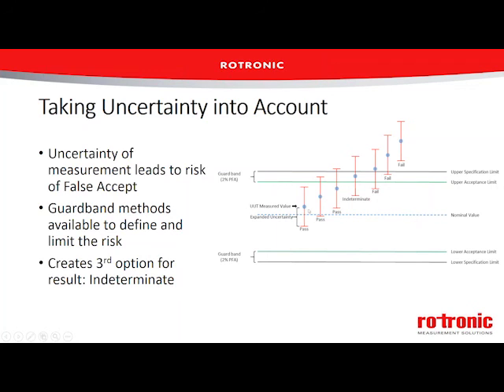And to introduce this topic a little bit, we don't have a whole lot of time to talk about it, so we'll give it a brief introduction. What we've got here is a diagram of possible measurement results. We've got a nominal value or a reference value, and then we've got sample measurement results that an instrument might give us. So these are all the results from our unit under test, and ideally we want them to fall within the manufacturer specification limits, which are these black lines here.